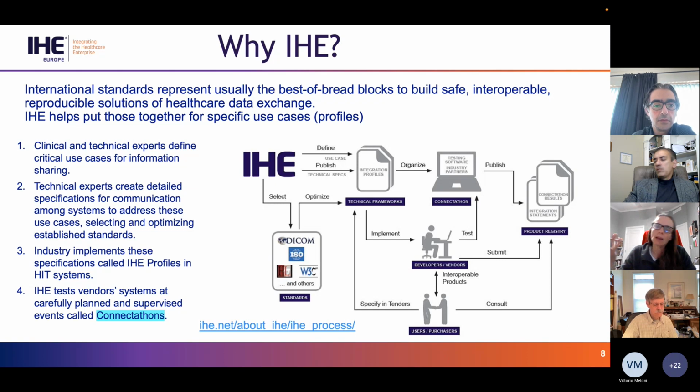This helps find things that we missed when we wrote the profiles, and also tests the ability of your system to properly utilize these profiles. At the end of the Connectathon, you can publish your test results and statements, and your future integration partners will know that your system is ready to cover those use cases.